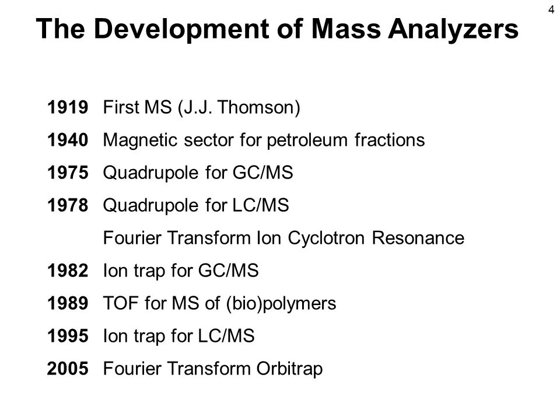1982 saw the advent of a very important mass analyzer, the quadrupole ion trap. The interesting feature of an ion trap is that ions are trapped in a kind of curved quadrupole. So you can trap a certain number of ions, and then you can do gas phase chemistry with these ions, for example fragment them into pieces or react them with other ions. An important feature of the ion trap is that it is a very small mass analyzer, and with recent developments the first portable mass spectrometers contain ion trap mass analyzers.